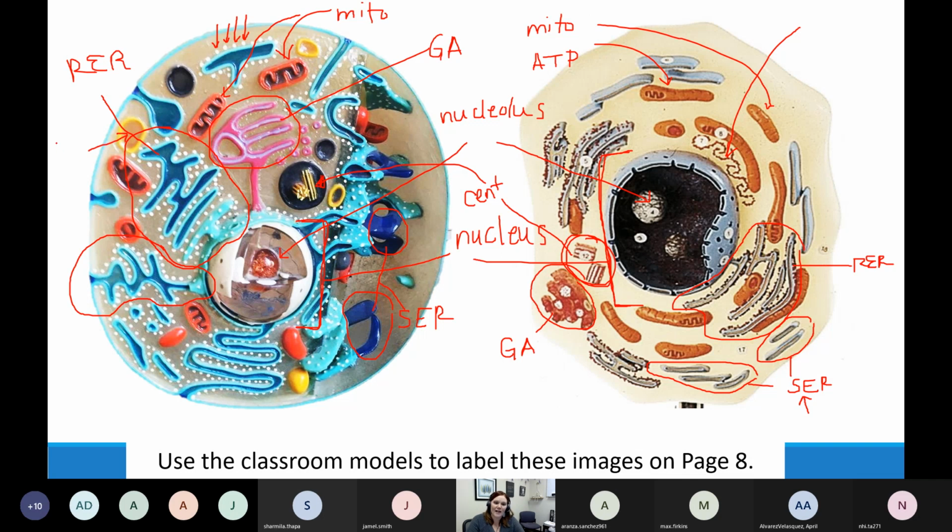I'm going to hypothesize that these yellow ones are those things we talked about in lecture called lysosomes. Lysosomes were the organelles that help to digest things, to recycle things, get rid of waste. I'm guessing that that's what the yellow things are, but there's not anything for sure that makes the yellow things look different than the dark things. That's why I'm not going to ask you to identify them.